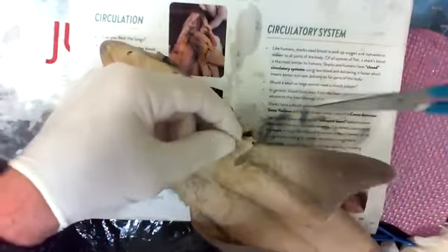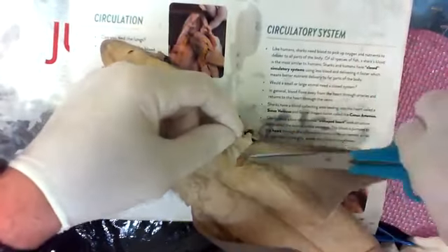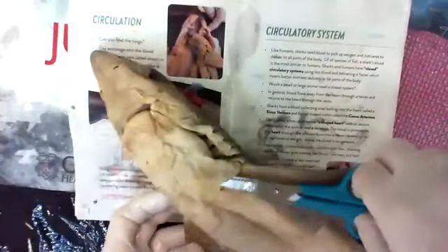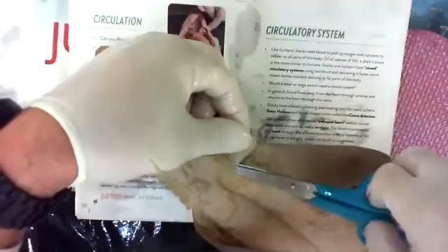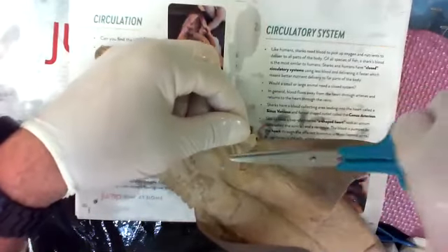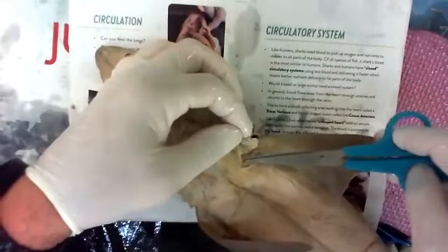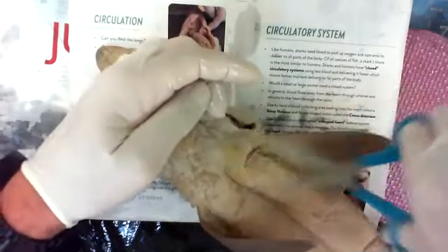So this drives me crazy. I love the students over at the med school, but they're going to be doctors, and so they think, cool, I'm going to have a scalpel and I'm going to cut things. But in reality, scalpels, they're really sharp, but they cut things you don't want to cut. So most surgeons will use a scalpel to get into the skin like this, but once they're in, they take a pair of scissors just like this, slide it under the skin or between the organs they want to isolate, and they open it up.